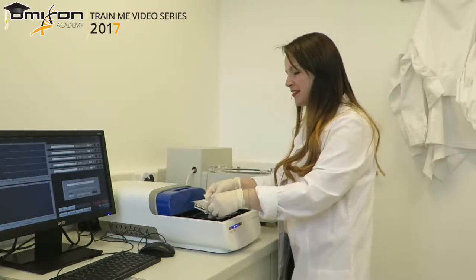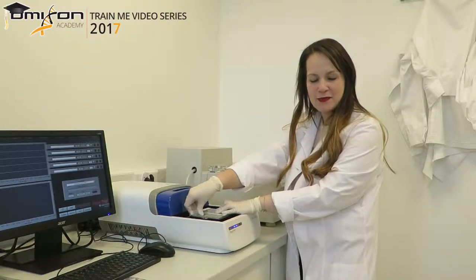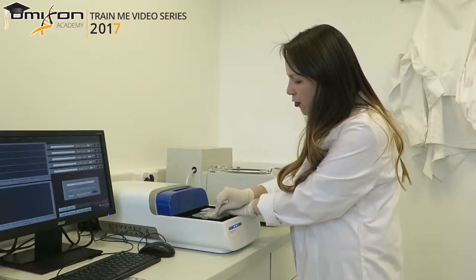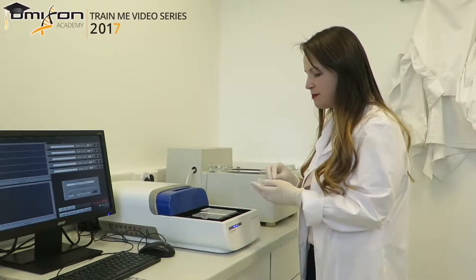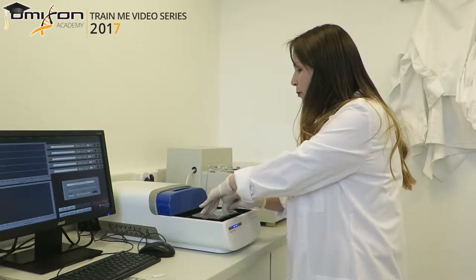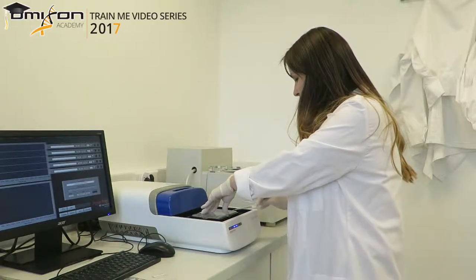We put the cassette into the machine, uncover it, and take off the tapes to completely open up the ports. We want to make sure we open the tapes very carefully so that the buffer doesn't splatter. We also want to make sure we uncover both sides — both the positive electrode ports and the negative electrode ports.